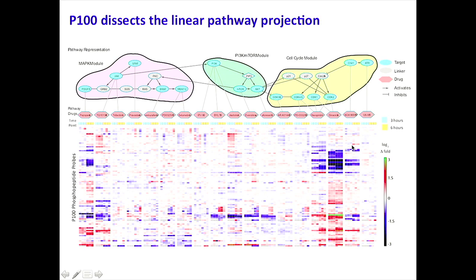So we decided to try to quantify this in a more formal way. And what we did is simply collapsed all of the replicates and measured the correlation among all the replicates and then collapsed those correlations by the drugs to which they were related.